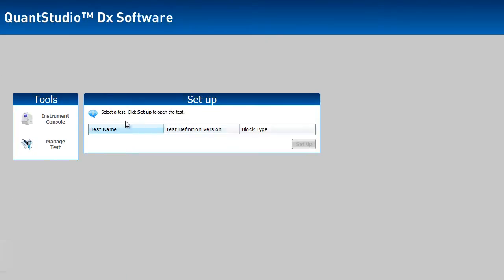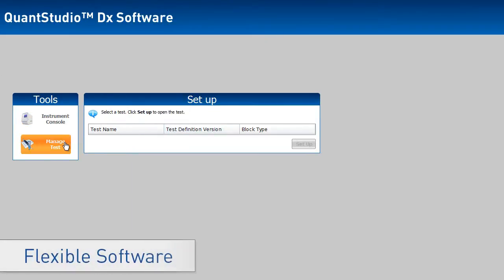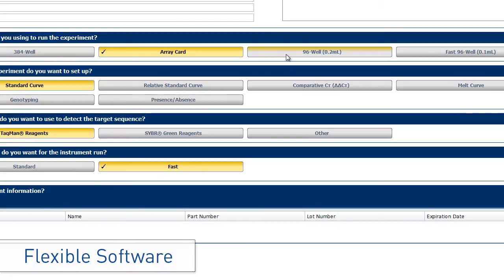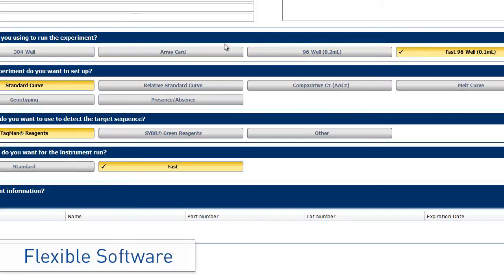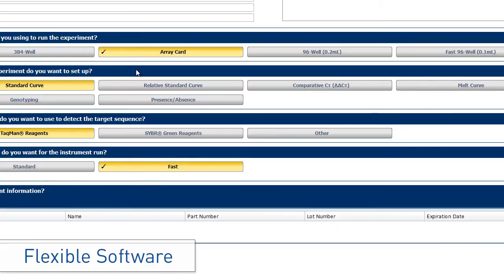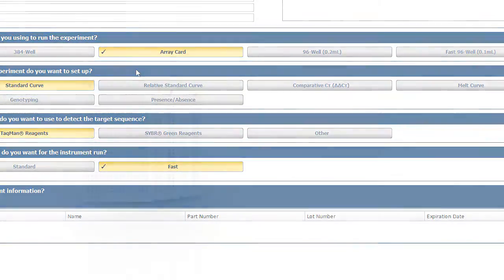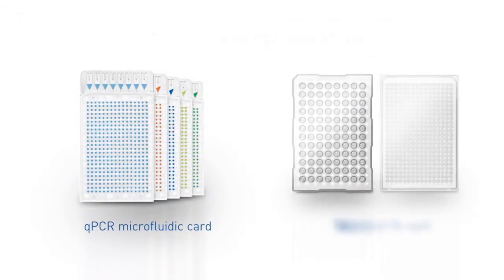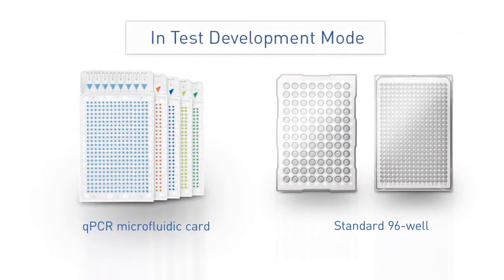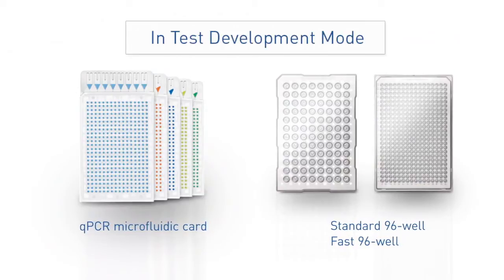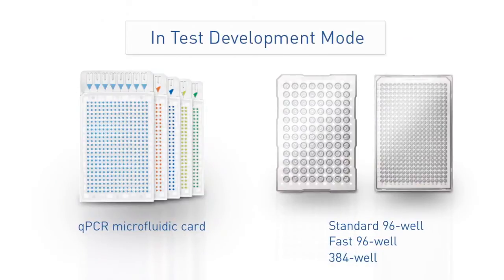In test development mode, you can create new assays and perform clinical research using the 96-well standard and 96-well fast blocks, the 384-well block, or the qPCR microfluidic card block, which uses Life Technologies' exclusive qPCR microfluidic card to perform 8x48 simultaneous reactions without the need for liquid handling robots.